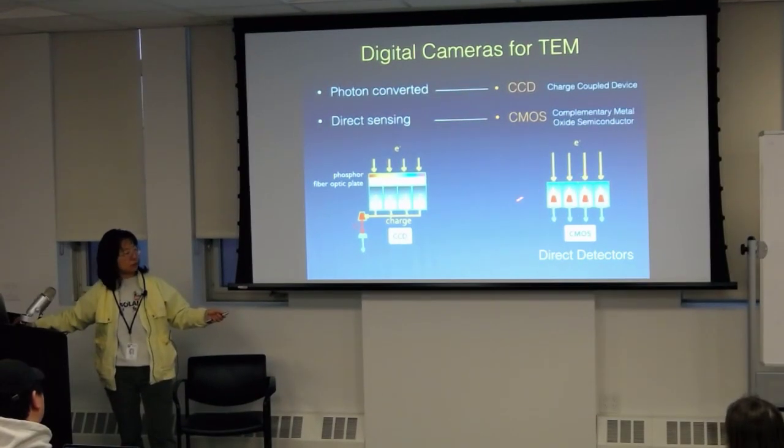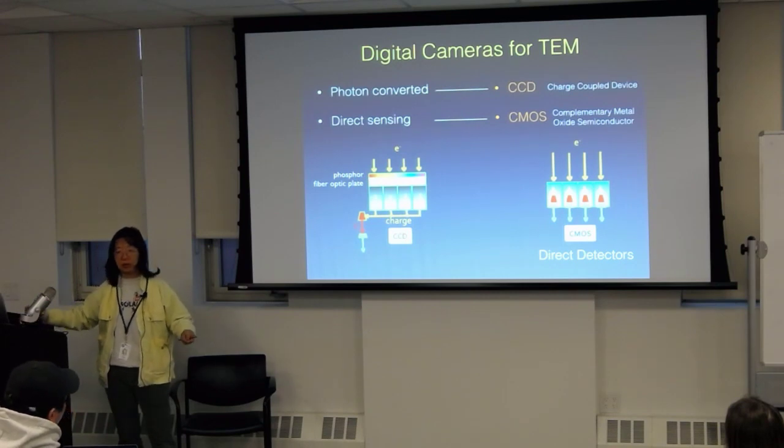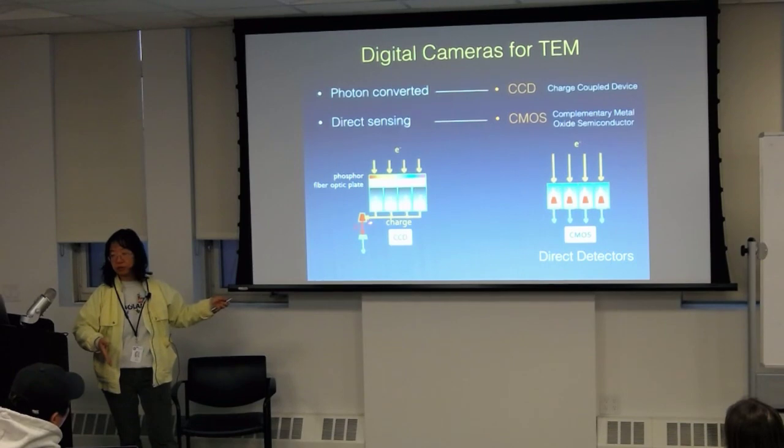Okay, the CMOS and the CCD are different in that, fundamentally, in the CMOS each pixel has its own way of converting the electrons directly to a digital signal. So each one can be its own output. That makes it faster because you don't have to wait for the whole row and then do things like that.